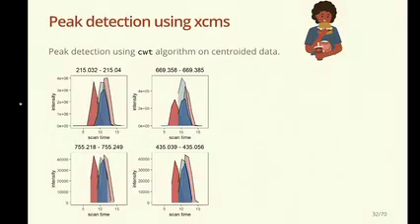So, of course, the ambient peak does correspond to, or looks like, a chromatographic peak, and at least the vendor-specific software does it as well. Can we not treat it as a chromatographic peak? So I'll dive a bit more in depth with XCMS, as we have a bit more control over the different processing steps, and we can inspect all of the data at the different stages of data analysis, which is of course also very good for Aidan, because if you find a biomarker, then he'll be happy.